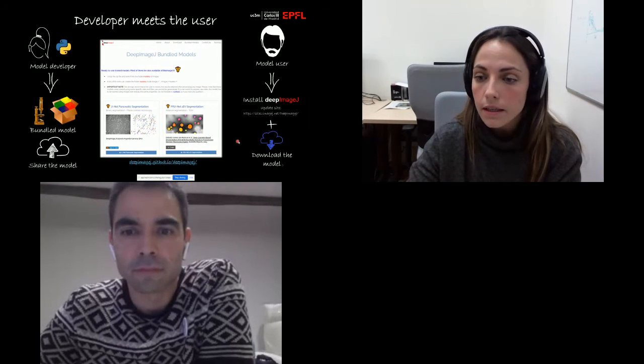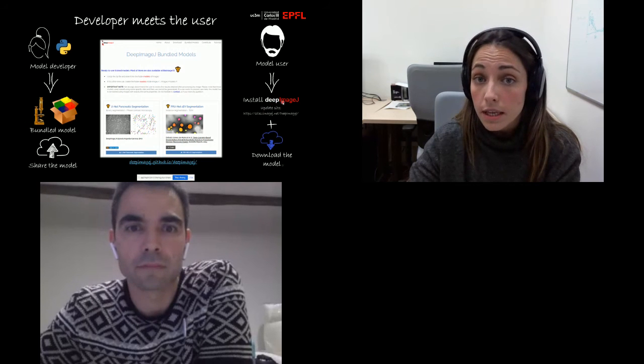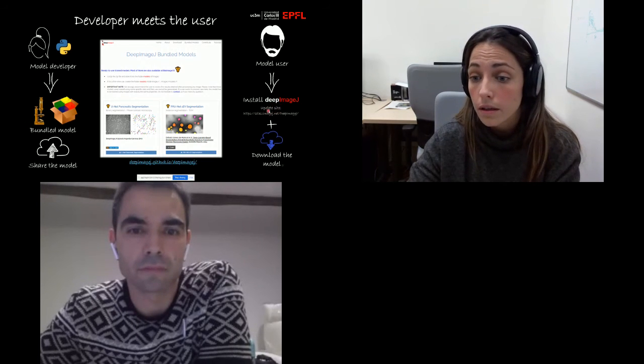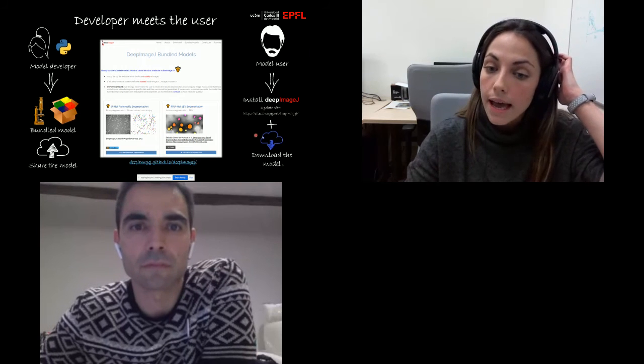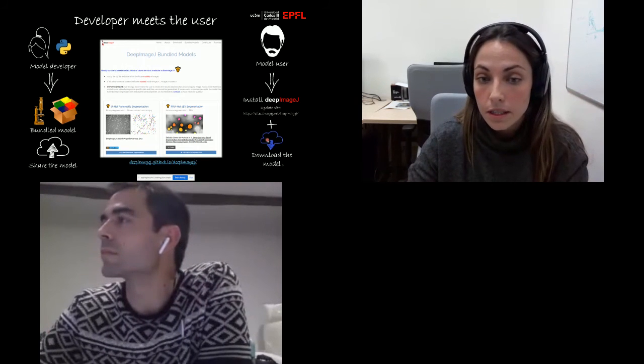And the user just needs to install DeepImageJ as any other plugin, or you can download it through the update site, or install it using our webpage tutorial, and download the model and just run it.